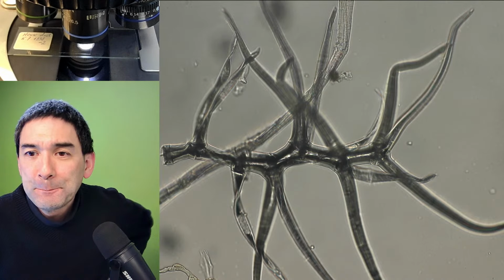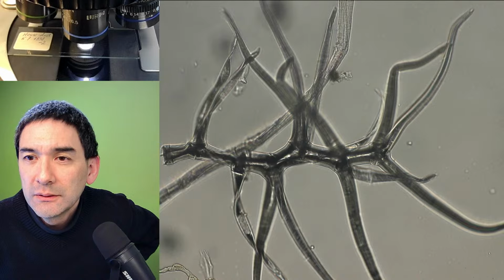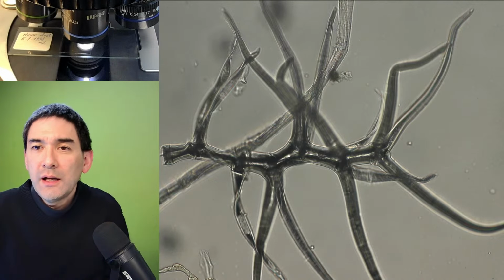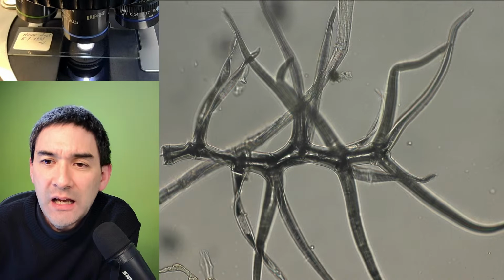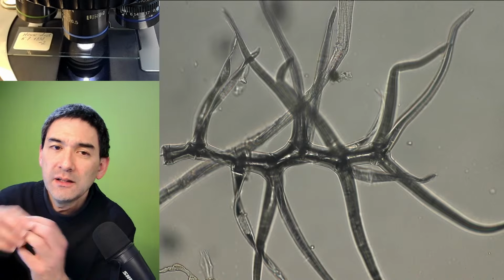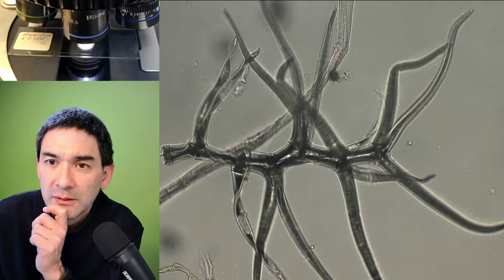Okay. Let me quickly have a look here. I will quickly read some of the comments. Okay, thank you, Jesse Ever Smaller, who did a little bit of research. From a quick Google, it seems the setae are made up of multiple fibers made up of chitin, usually arranged in a helical structure. Okay, so basically these individual fibers. So that's not chitin here because it's a plant thing.